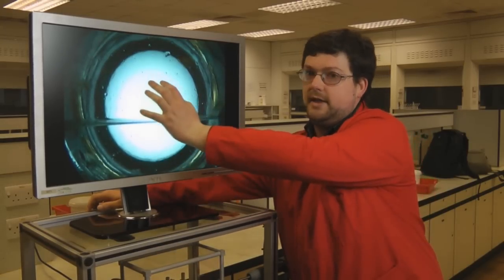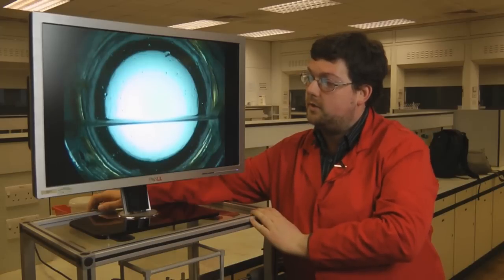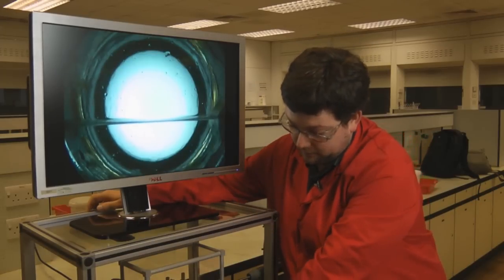We have a liquid and a gas on top, and we're going to heat it up. If we flick the switch on the front of the demonstration, we'll heat the cell up. Because it's a closed system, we'll see the liquid start to boil.